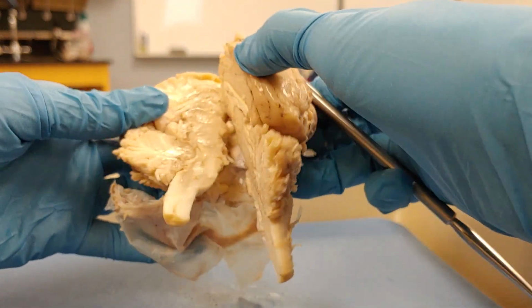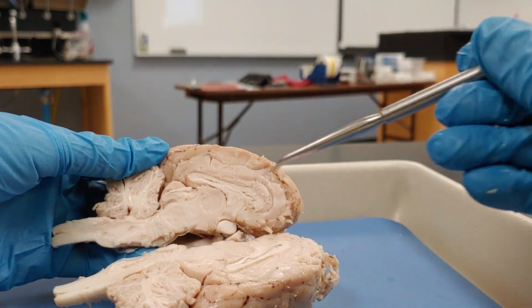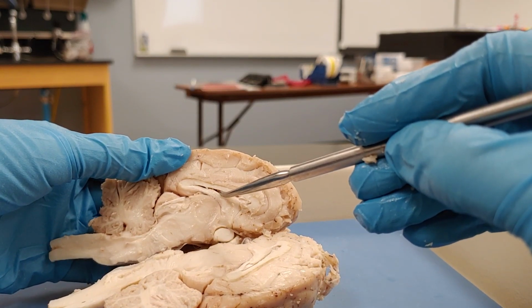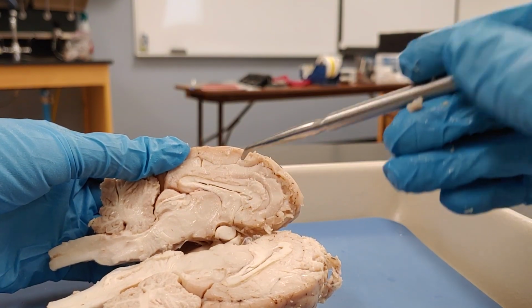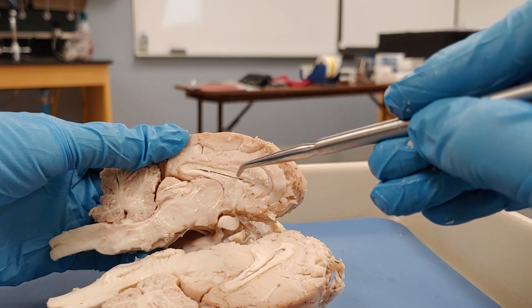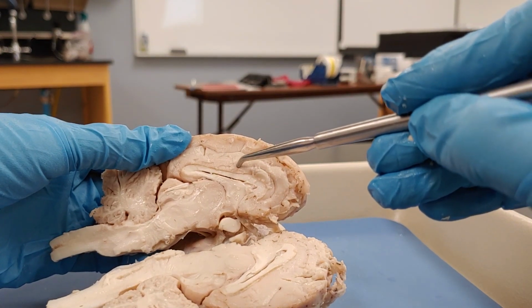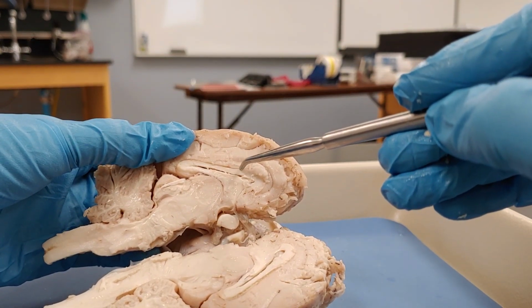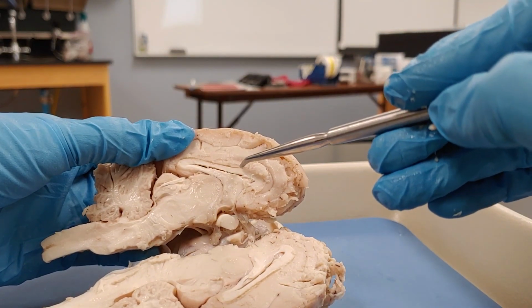If we open the brain up, we can see the other structures that we need to take a look at. So starting at the front here, we have the corpus callosum. This region right here, this white region at the top, that is the largest commissural tract. That's the one that crosses from right to left. This is the tract that we talked about that was cut in the example of the epileptic patient who had the split brain that we were talking about in class. So there's your corpus callosum.